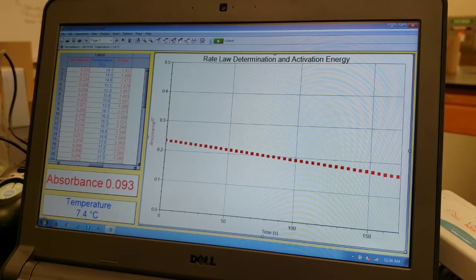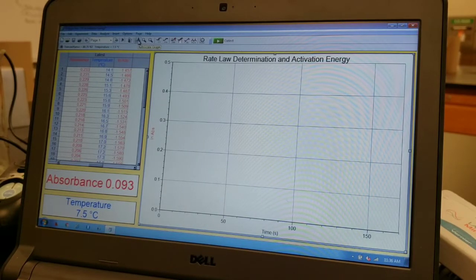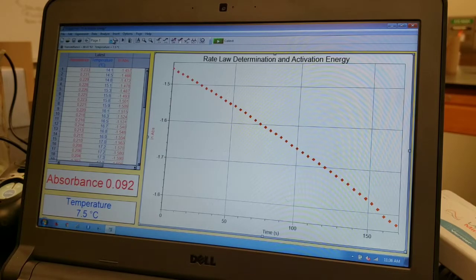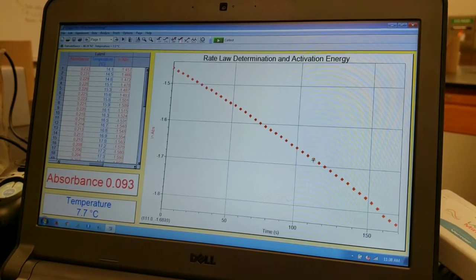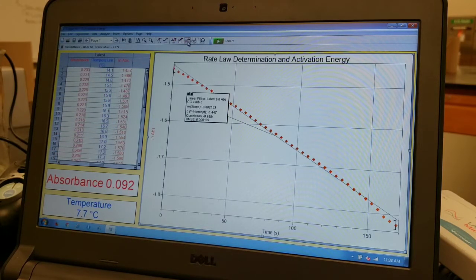Now I'm going to click back onto the graph itself, and instead of this graph reading absorbance over time, I'm going to have it read the natural log of absorbance. I'm going to have to auto scale my graph in order to see where the new line is. The slope or gradient of this line, the plot of the natural log of absorbance versus time, will reveal the rate constant. So if I go to linear regression and click, it will tell me the value of the slope. Now, because this slope is downward, it has a negative value. The value of k will be the positive value of this number.